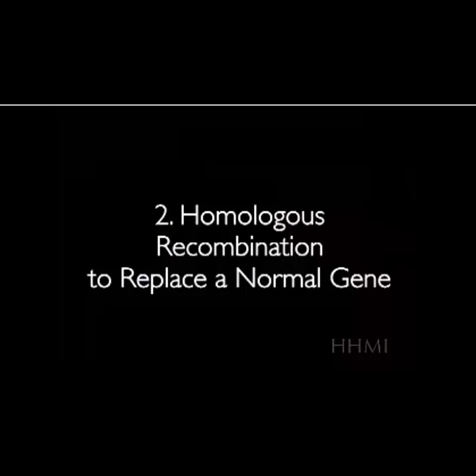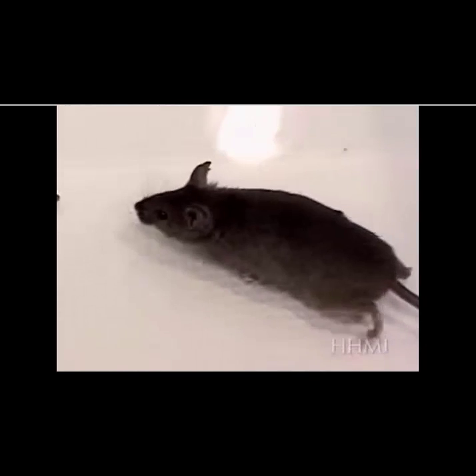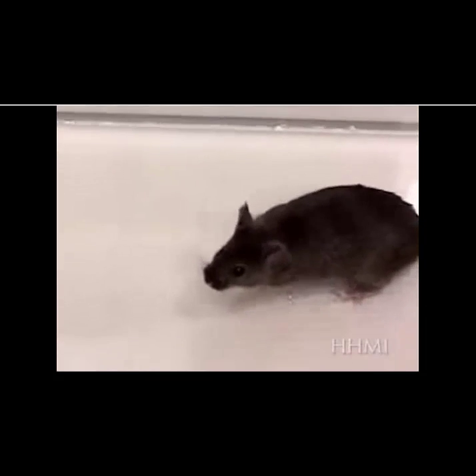The direct injection technique is limited because the transgene inserts in a random location, often with multiple copies, producing results that can be complicated to interpret. To create mice with specific genotypes, a method was developed that replaces a normal gene with a mutant transgene.